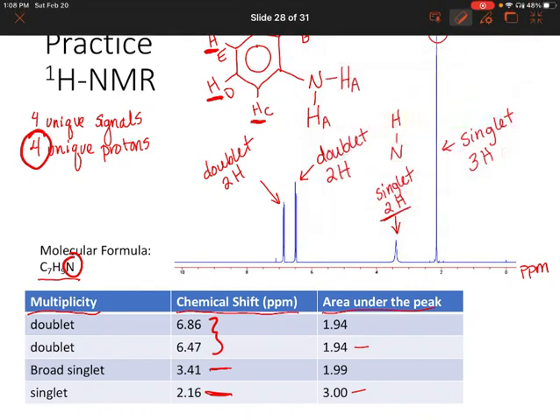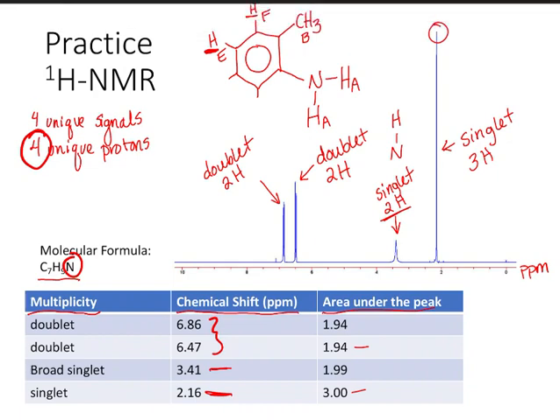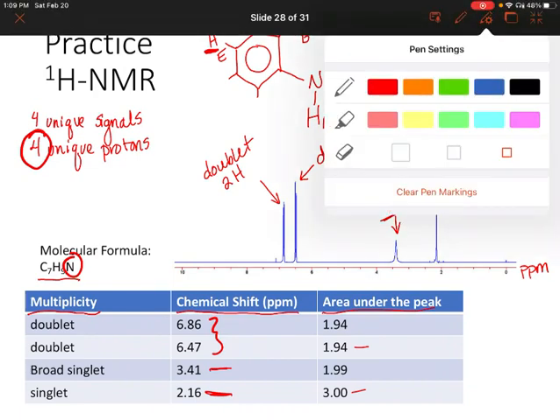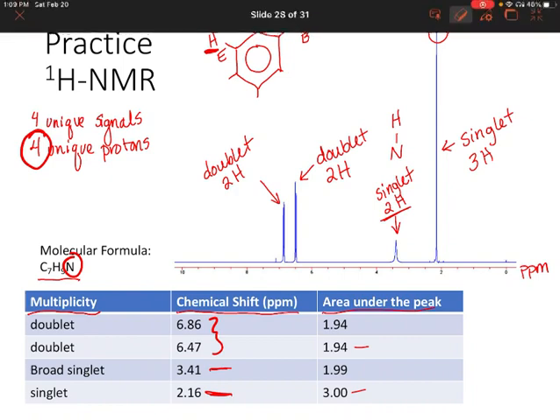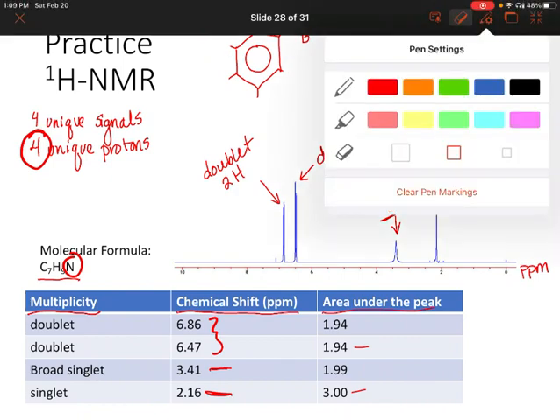All right, so I'm going to erase these protons, and then I'm also going to erase the nitrogen. There we go. I'm also going to erase the nitrogen group, and we'll show it somewhere else.